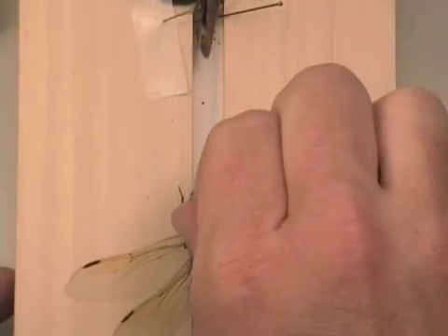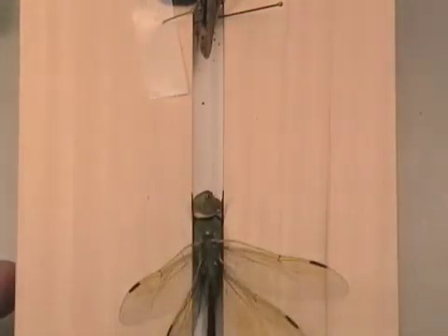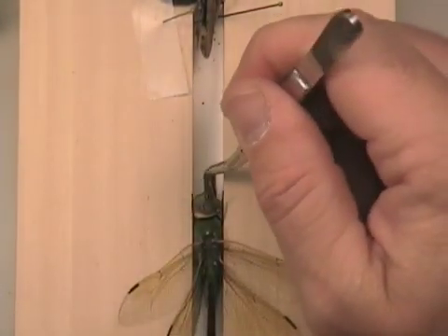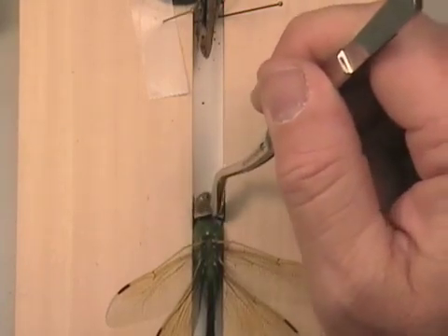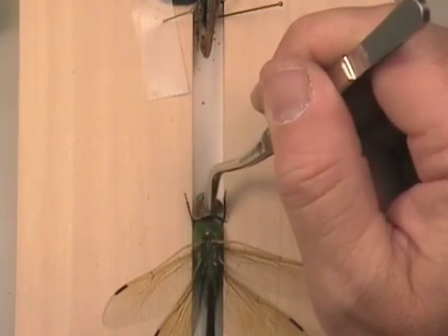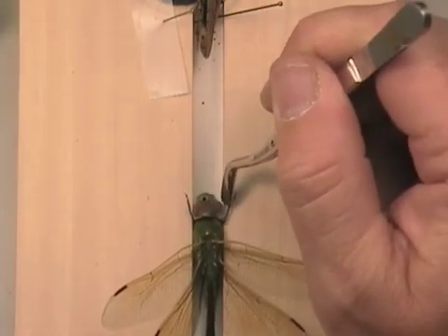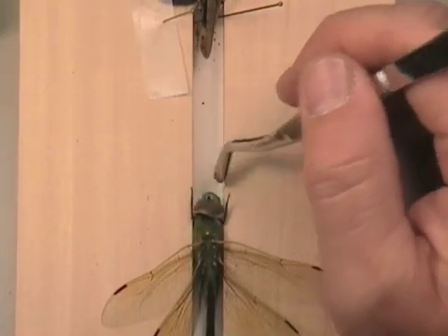We are now going to push this dragonfly down into the crack. The toughest thing is getting the head positioned properly, because their heads twist around really easily. I am not going to worry about the front legs that are tucked way up.